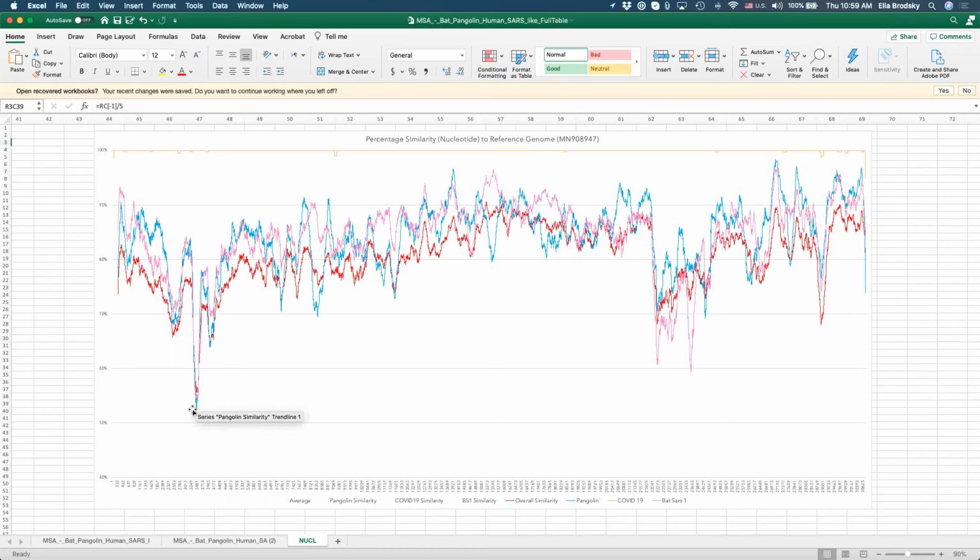So this is around 3,400 or 3,600, and this is that 22,000 to 25,000. Okay, great. So maybe also over here. This is 70% similarity, so we can just take that as a threshold and say, okay, these are some of those regions.